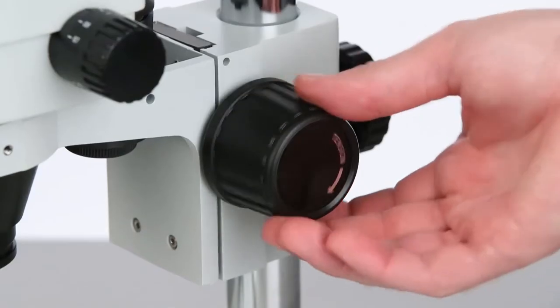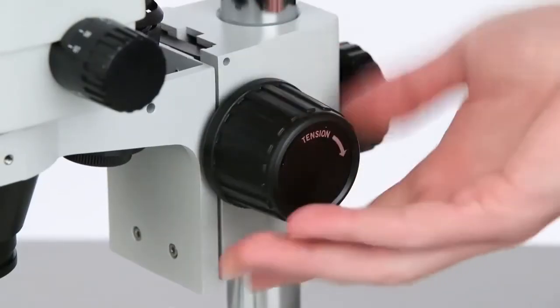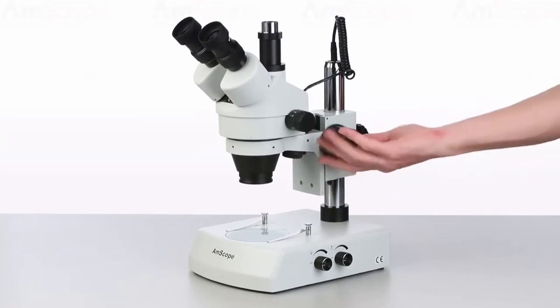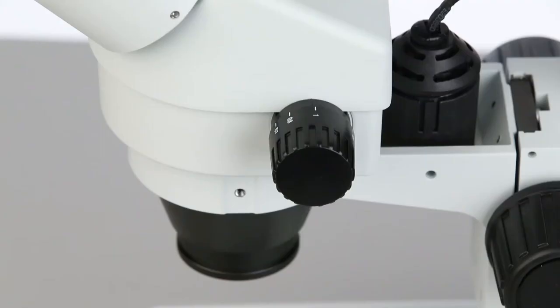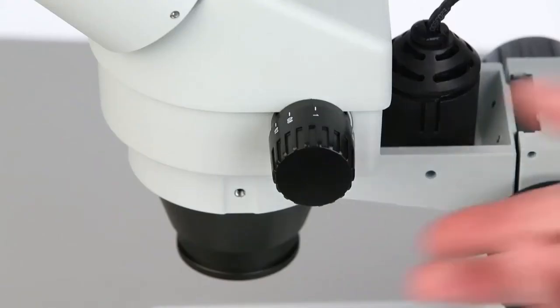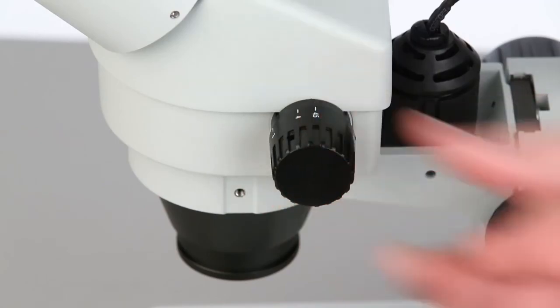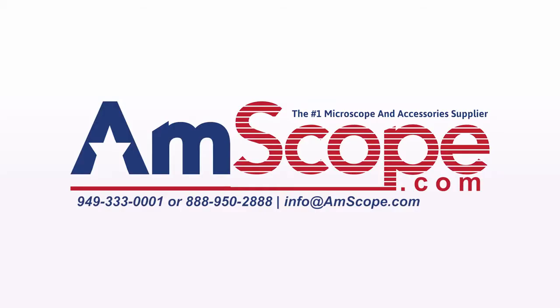There is an adjustment knob on either side of the microscope to control your fine focus. The calibrated knobs on either side of the head control the zoom from 0.7x to 4.5x magnification.